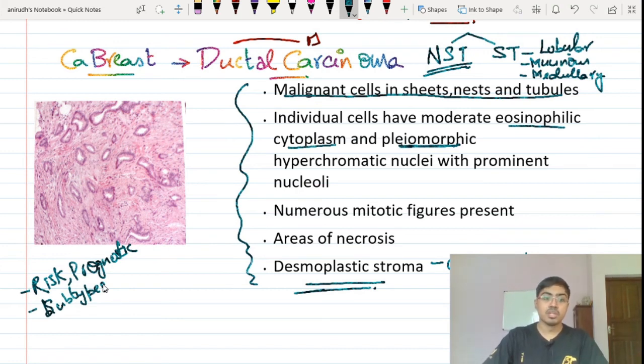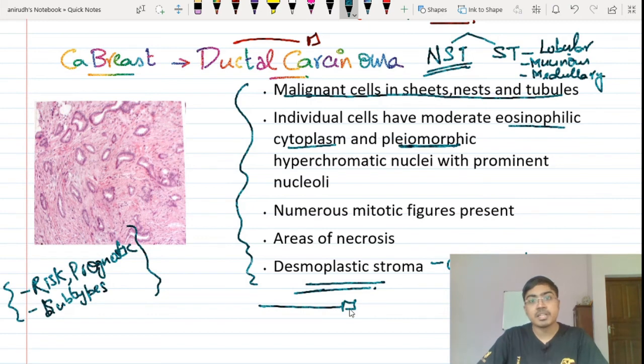Those are also very important questions, isn't it? And these are the types of questions that you can expect as sub questions whenever a question on carcinoma breast is given in the exam. So I would recommend you go through this topic and learn all the important points because they can be asked as sub questions. So far as this slide is concerned, you can remember these points. And yes, that's all with carcinoma breast. It's a very expansive topic. Now let's go to the last one.